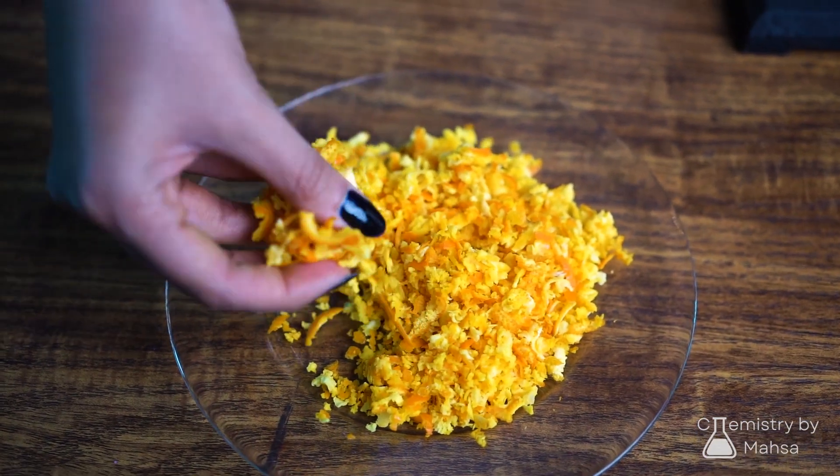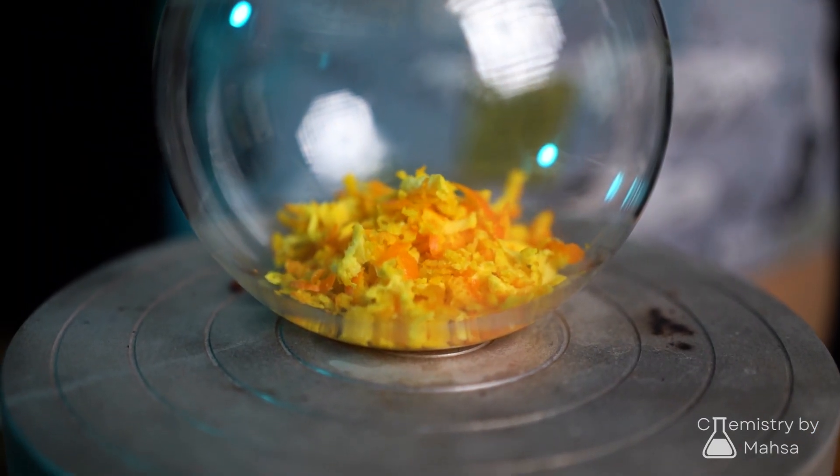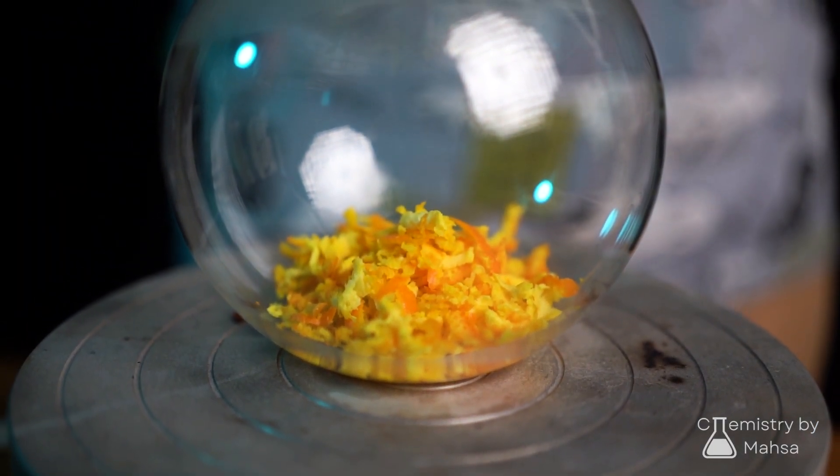Most of orange's essential oil is in its peels, so we need to peel it off. The smaller the pieces, the better the process, so we can use a grater.